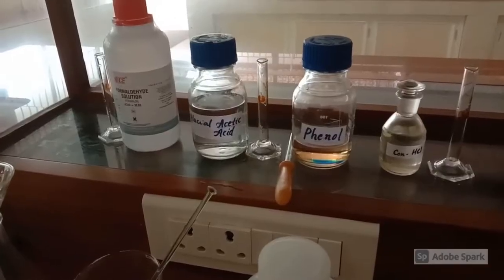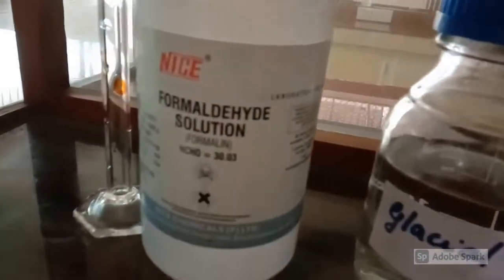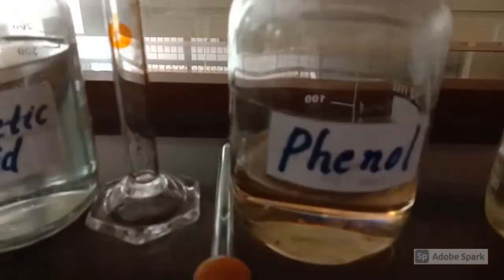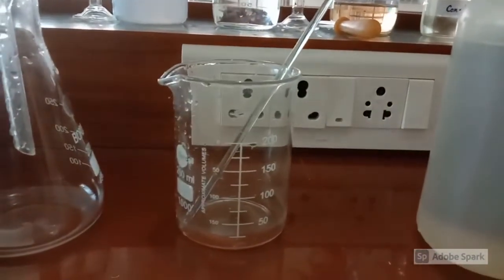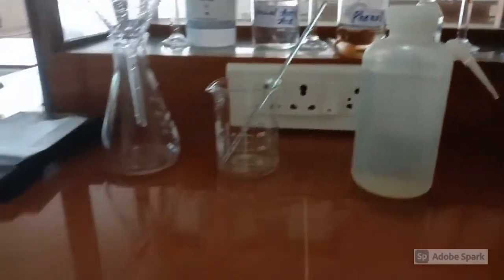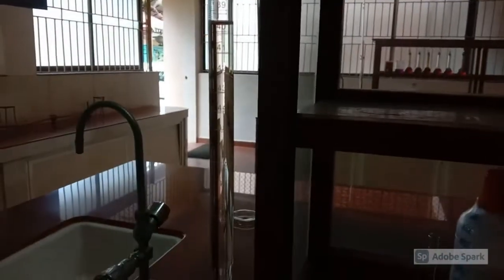The chemicals and glassware used in this experiment are: formaldehyde solution, glacial acetic acid solution, Phenol, concentrated HCl, a conical flask, a 250 ml beaker, a wash bottle with distilled water, a towel, and a burette.